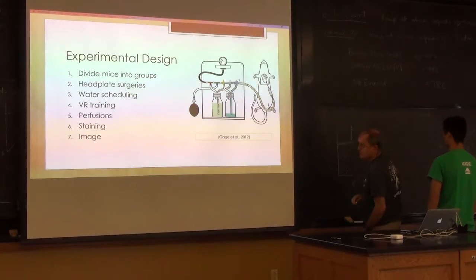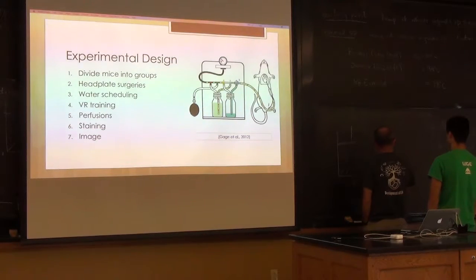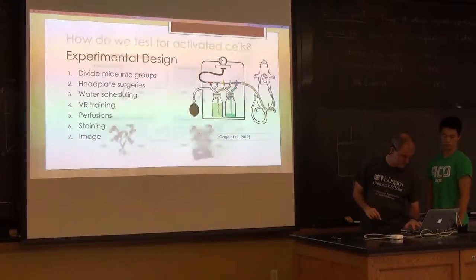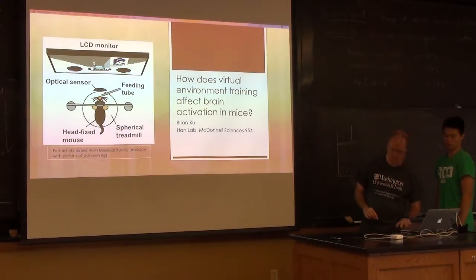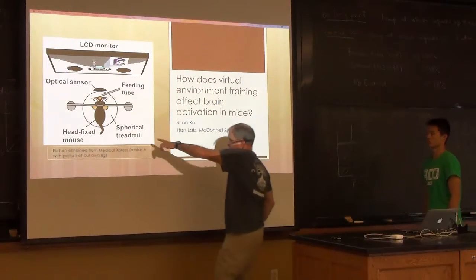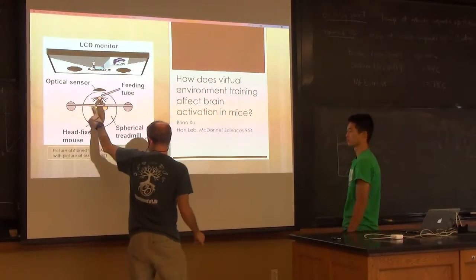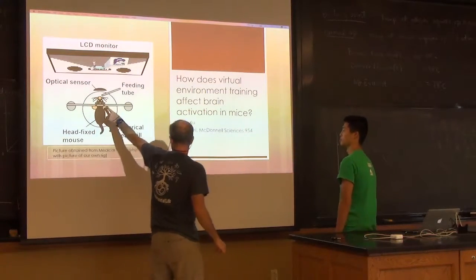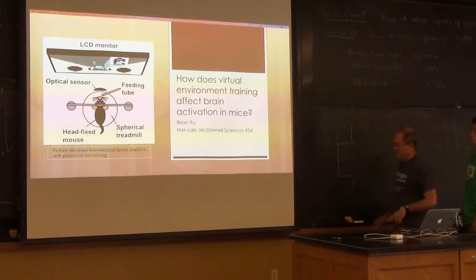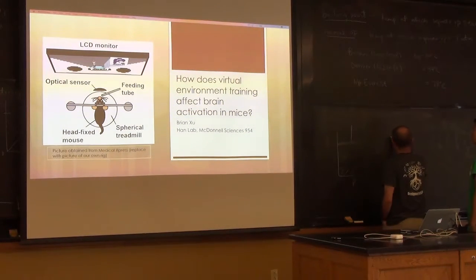You're going to split them into three. This is pretty simple schematic. You have them in that head plate thing. So have the schematic of mouse in head plate.